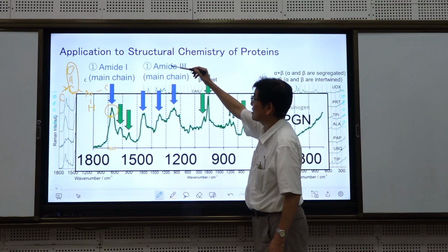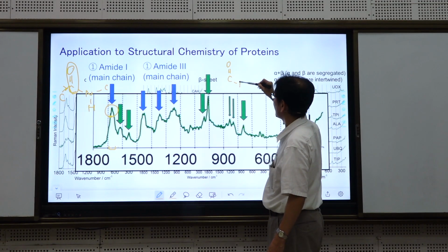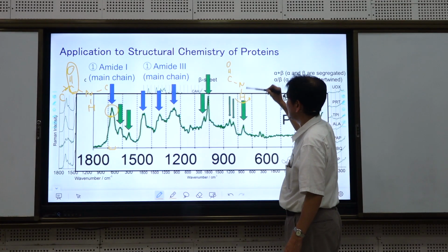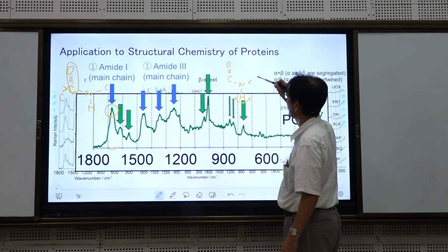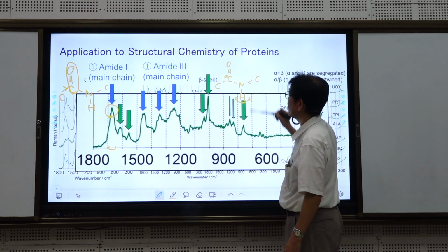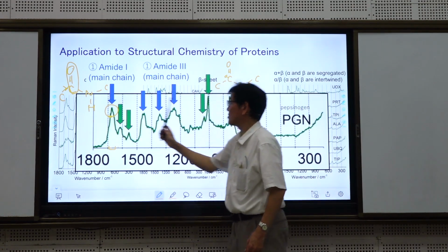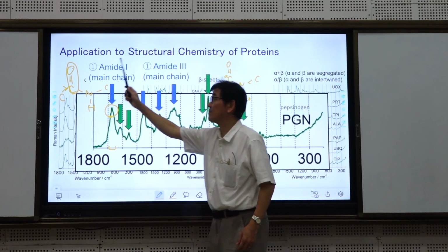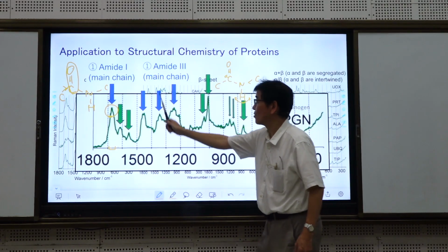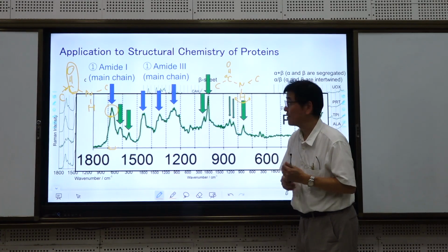Amide 3 is the main chain vibration, and it is mainly NH bending plus CN stretching. There are different modes and the peak position is different, but anyway, it is the vibration of the main chain. So by analyzing these modes, we can get the information about the peptide main chain.